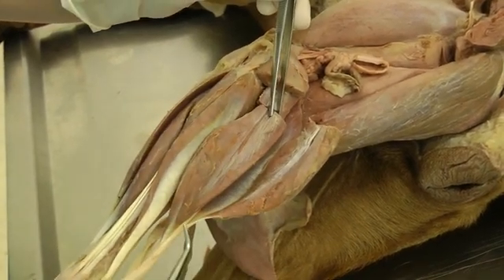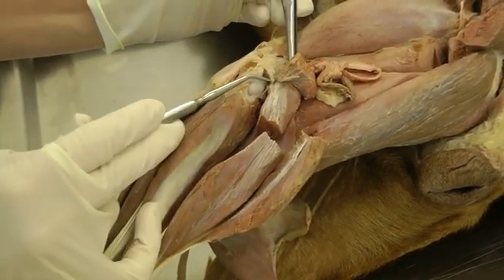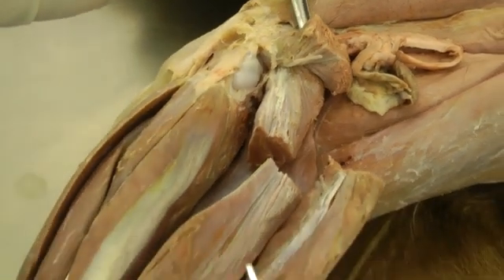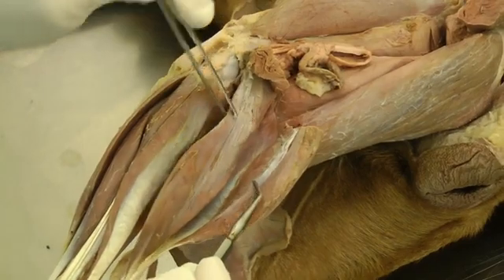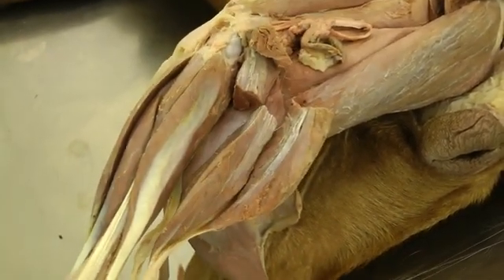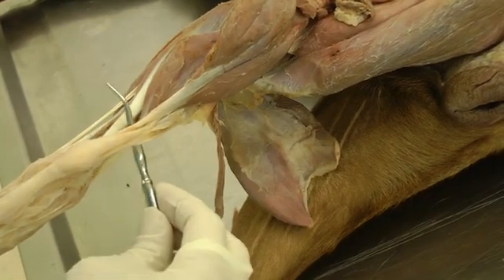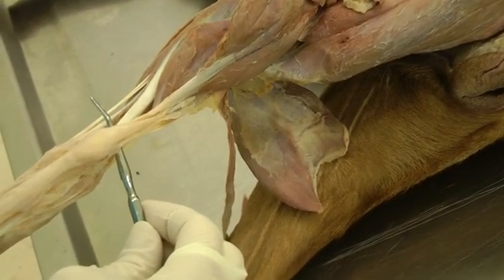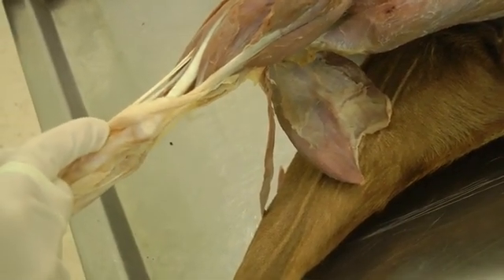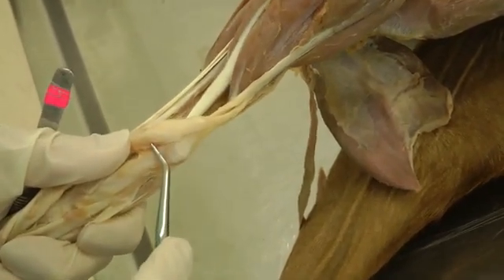Superficial digital flexor is in between. When you reflect the stump of gastrocnemius, the book tells you to look for this sesamoid bone right here. The superficial digital flexor will also be transected so we can see the deep digital flexors. On the caudal edge, the common calcanean tendon is where all of these structures come together and go over the hock. You want to slip the superficial digital flexor tendon off the hock and see the calcaneal bursa.